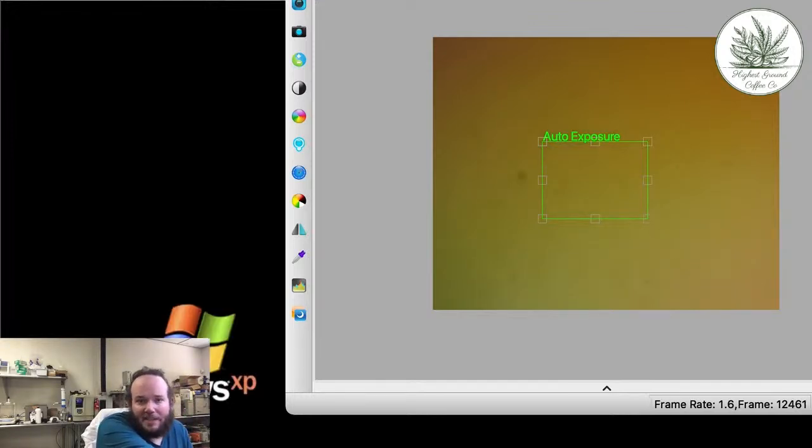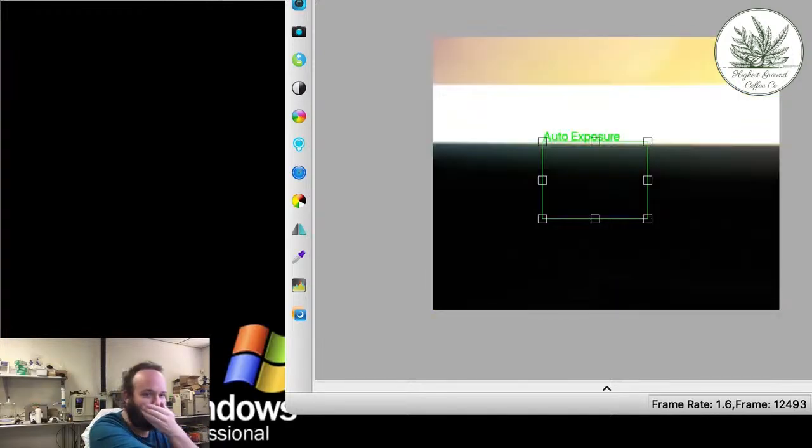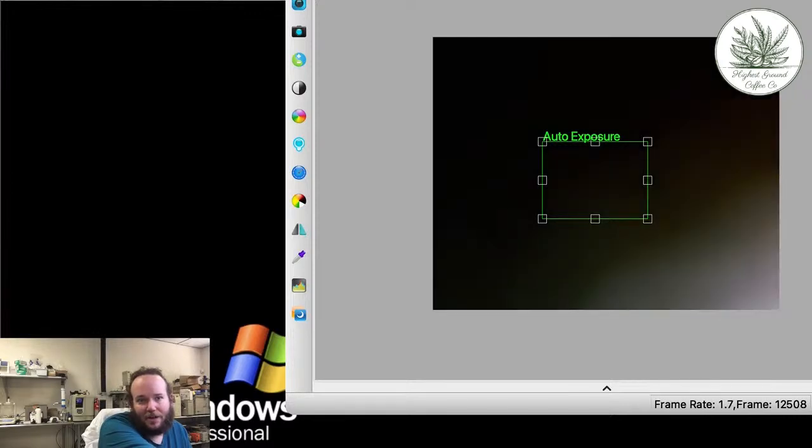So we're on the 60 and I'm just trying to find somewhere with focus, and so far I'm not having much luck, despite this thing being pressed almost all the way up to it. So I'm popping back down to the 20. My goal here is to find something I can get an image out of and then zoom in on it from there.